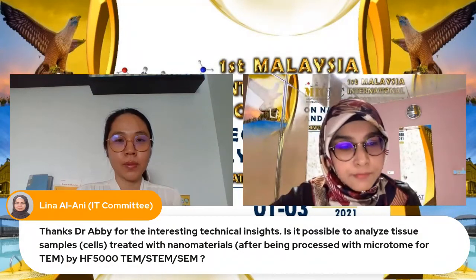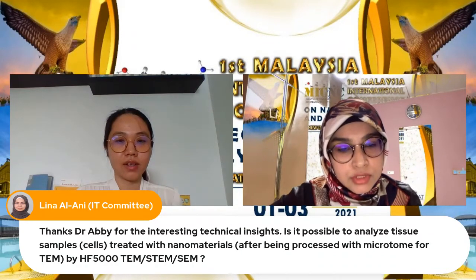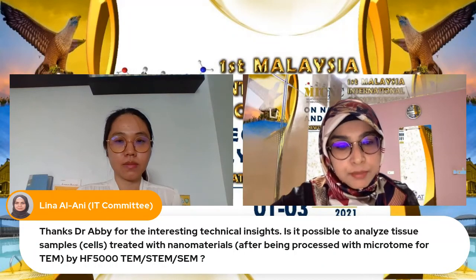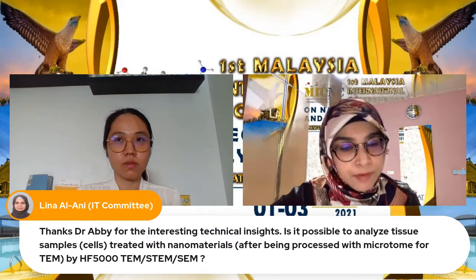So the first question is from Ms. Lina Alnani. Thanks, Dr. AB, for the interesting technical insights. Is it possible to analyze tissue sample cells treated with nanomaterials after being processed with microtome for TEM by HF 5000, TEM, STEM, and SEM?